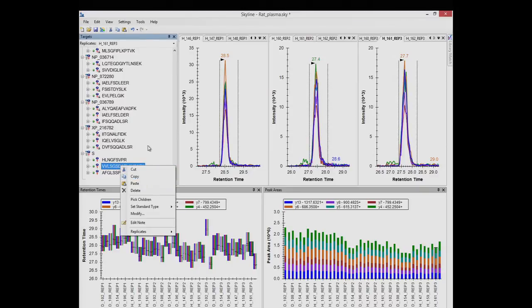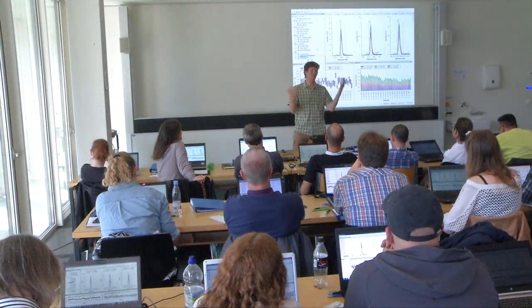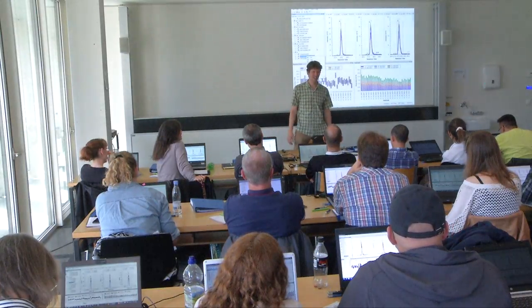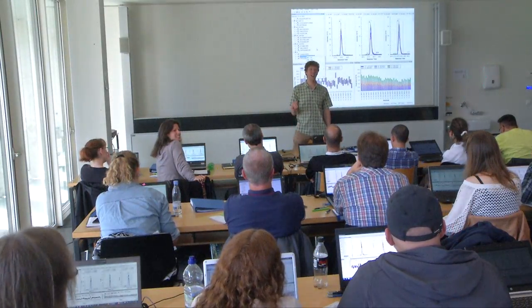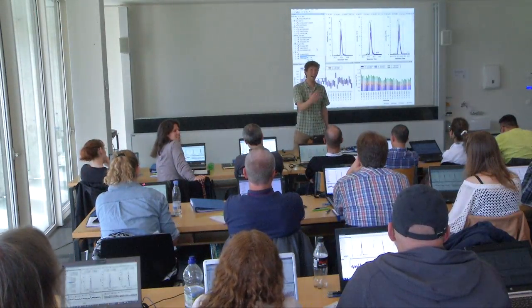Could you compare this to the total ion current of all? Yeah, so why is that a bad idea in targeted proteomics? No, that's an important point. So why do we inject peptides at all? Why don't we just do total ion current with a targeted experiment? It's a very common thing to do in a DDA experiment, right? So why?